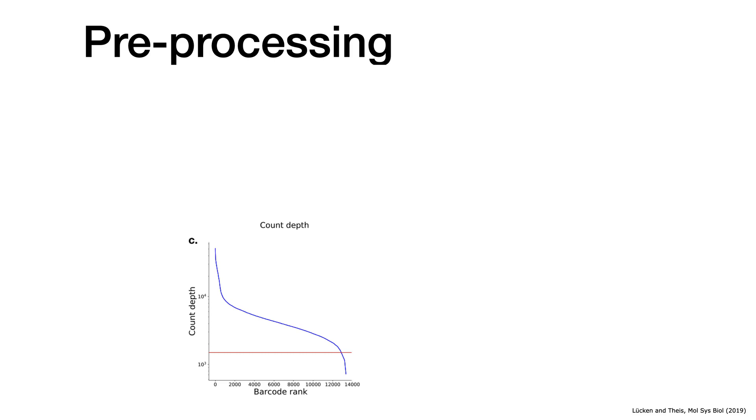In this picture here it's the other way around, but anyway, so you can sort them. You have barcodes that have a lot of molecules assigned to in a 10x experiment, so these are actual cells.